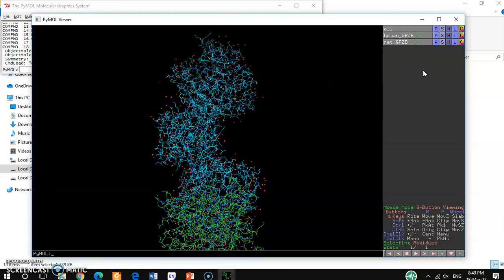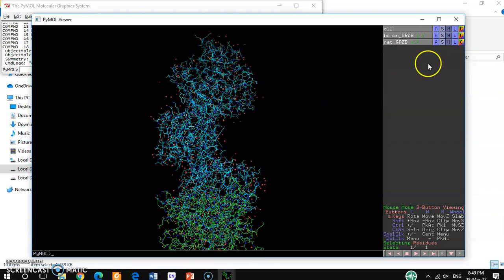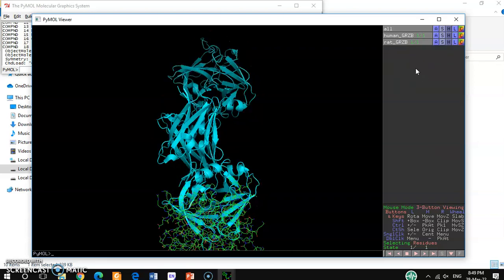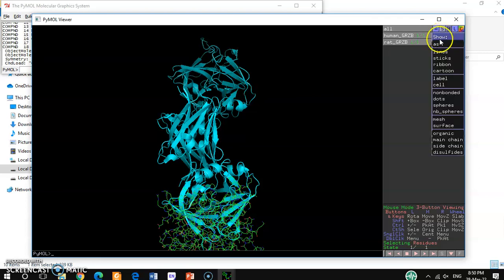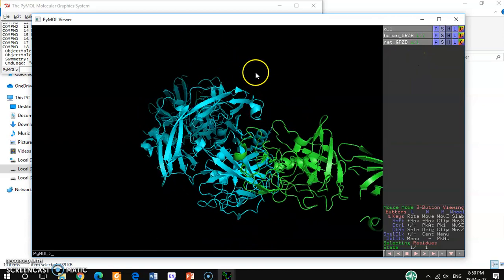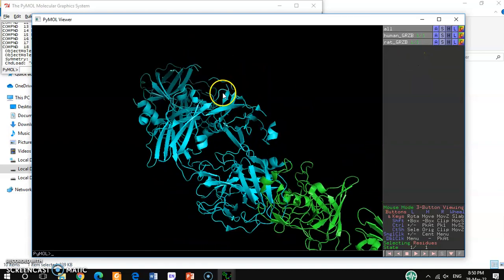To visualize it conveniently, I want to change the display style. First, I want to change it to the cartoon structure. The cartoon structure is easy to visualize. I'll also change the other structure to cartoon, so now both structures are in cartoon format.